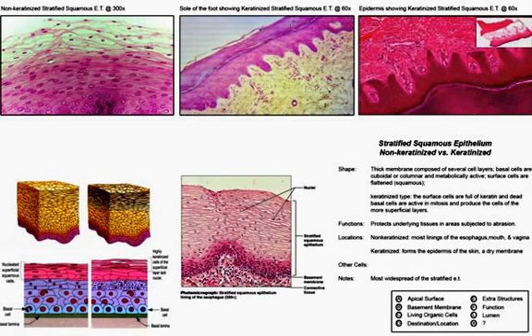If you see dead layers of cells out on the outer apical surface here, regardless of the thickness, then you're looking at a keratinizing layer, or the stratum corneum on the outer surface of the skin that protects our body from water level changes, or keeps us waterproof. It also protects us from abrasion and from any damage that might occur externally.